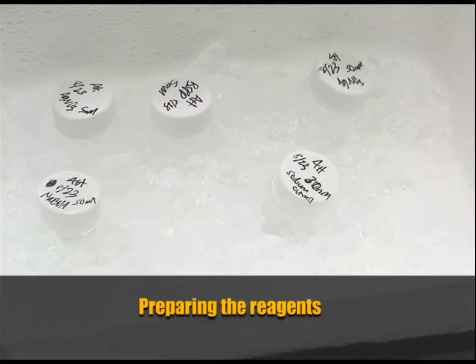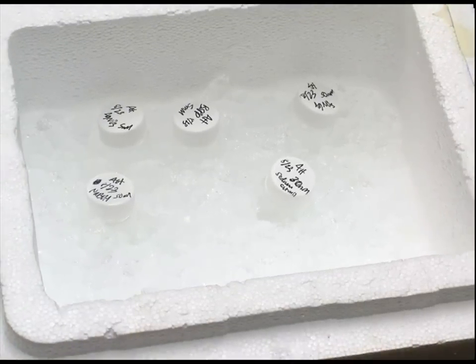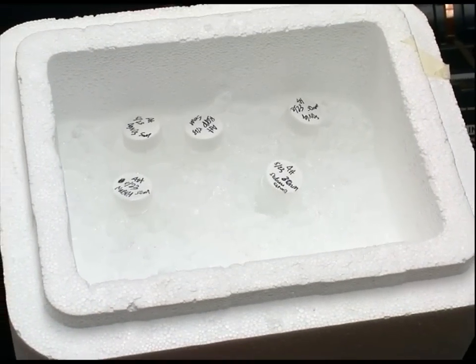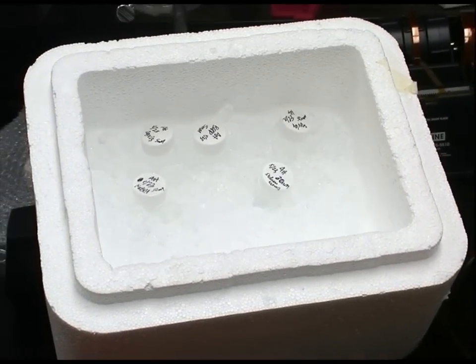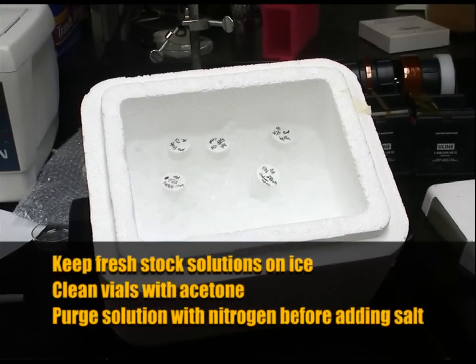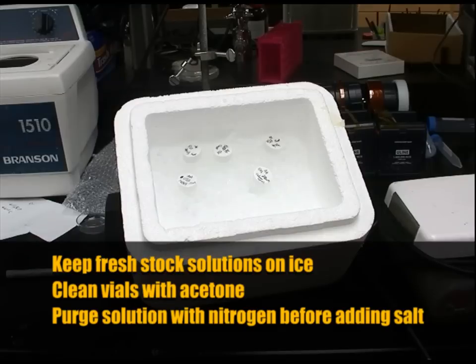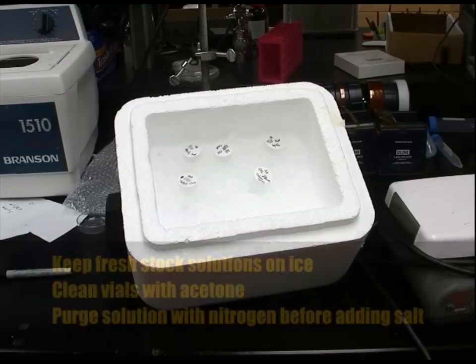We're now setting up to do the first step of silver nanoprism synthesis. For each synthesis we prepare the stock solutions fresh and put them on ice before using. All of the vials are cleaned with acetone and the sodium borohydride solution is purged with nitrogen before adding the sodium borohydride salt.